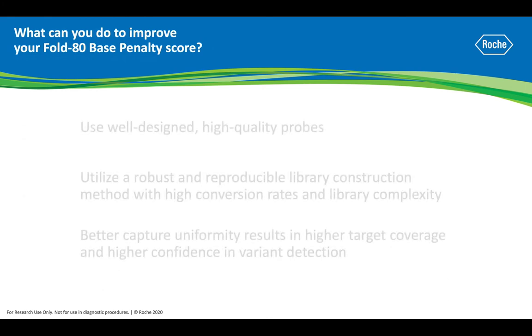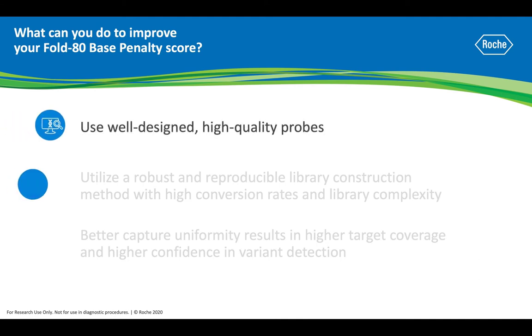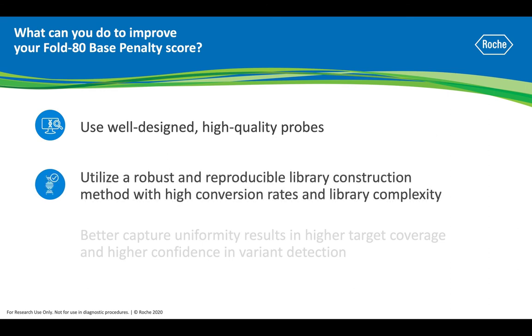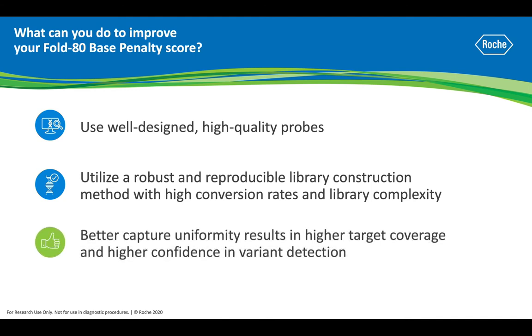What can you do to improve your Fold 80 Base Penalty score in targeted NGS? You can ensure that you're using well-designed, high-quality probes. You can utilize a robust and reproducible library preparation method that results in higher conversion rates and library complexity. With increased uniformity and lower duplicate rates, you can achieve higher target coverage at deeper sequencing depths, resulting in higher confidence for variant detection.